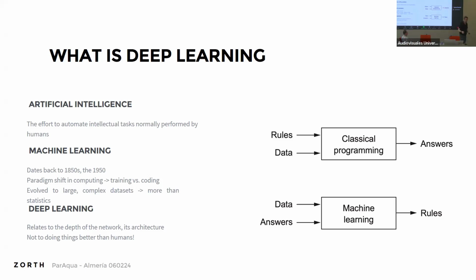So your data will be, for example, a set of images. You're going to give it a set of answers, saying these images are spirulina, these images are chlorella. Given enough data and enough answers, you're going to churn it through the machine learning machine, and it's going to give you a set of weights, and those weights, after training, determine the rule.